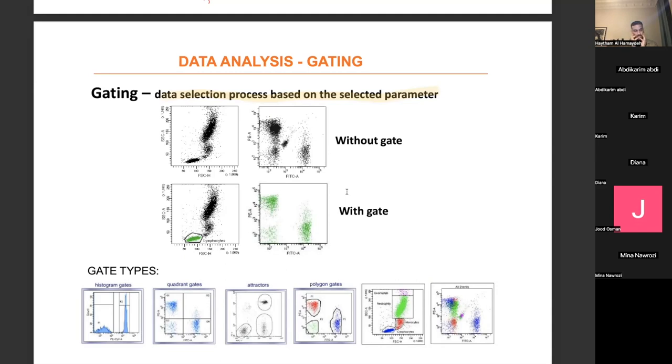You take an antibody with a color and put it on the cell you want to know about. And then you get the green color, and so it tells us on the graph where they are. How do we get to the next graph? If we say we want to have CD4 or CD8, we search for these specific antibodies and the specific data we have in green. And then we have plus plus, plus minus, minus minus. So we basically separate them according to what antigens they have. Easy?